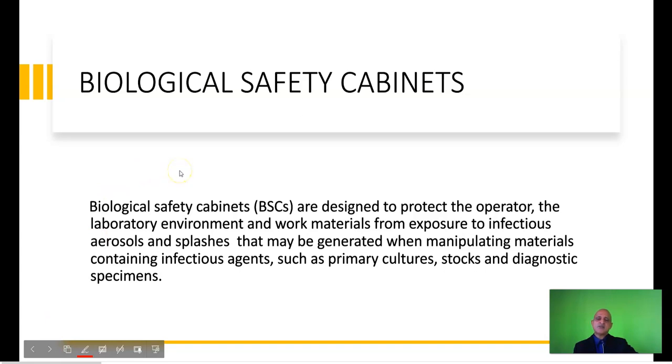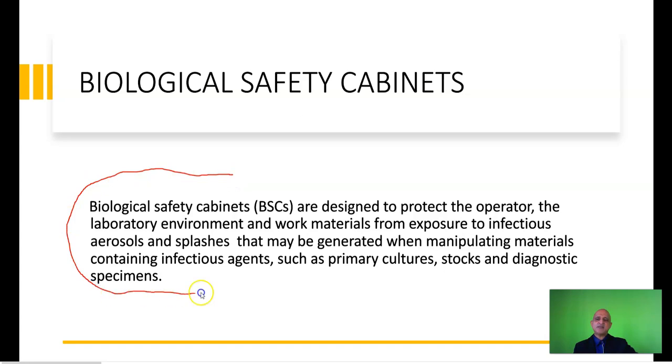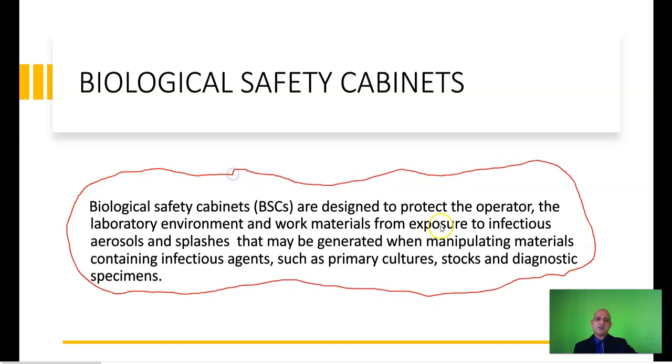One of the laboratory equipment which has been described in detail is the biological safety cabinet. Biological safety cabinets are designed to protect the operator and the laboratory environment and work material from exposure to infectious aerosols and splashes that may be generated when manipulating materials containing infectious agents such as primary cultures, stocks, and diagnostic specimens.